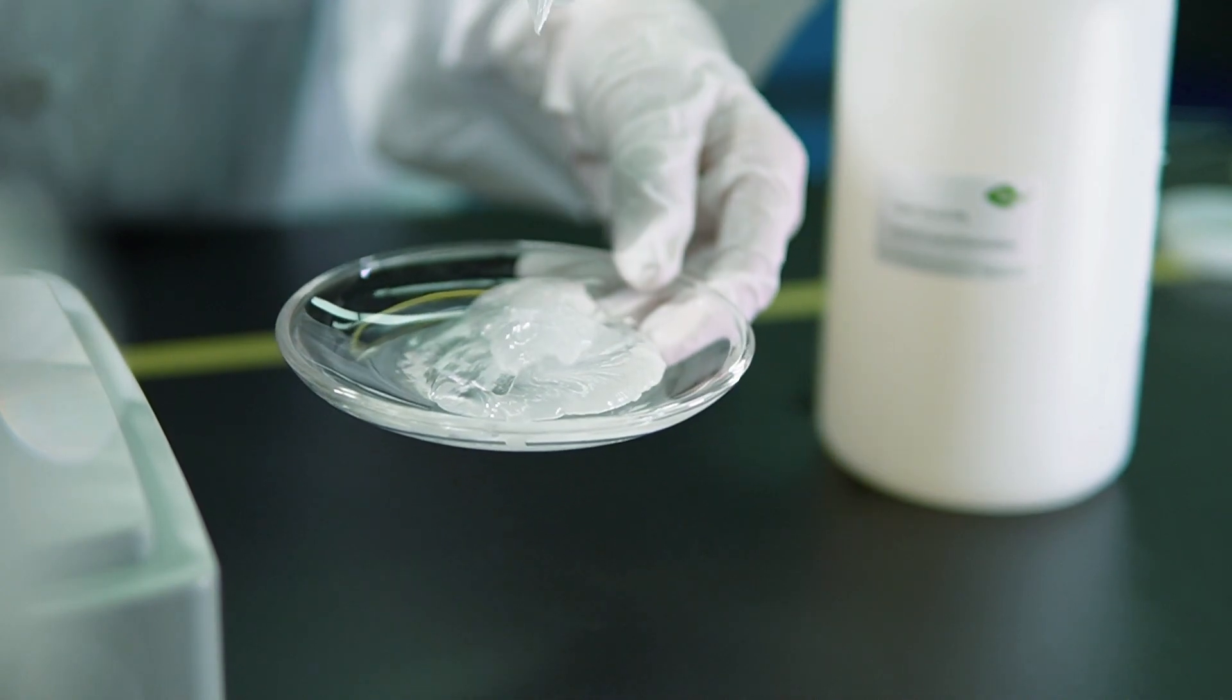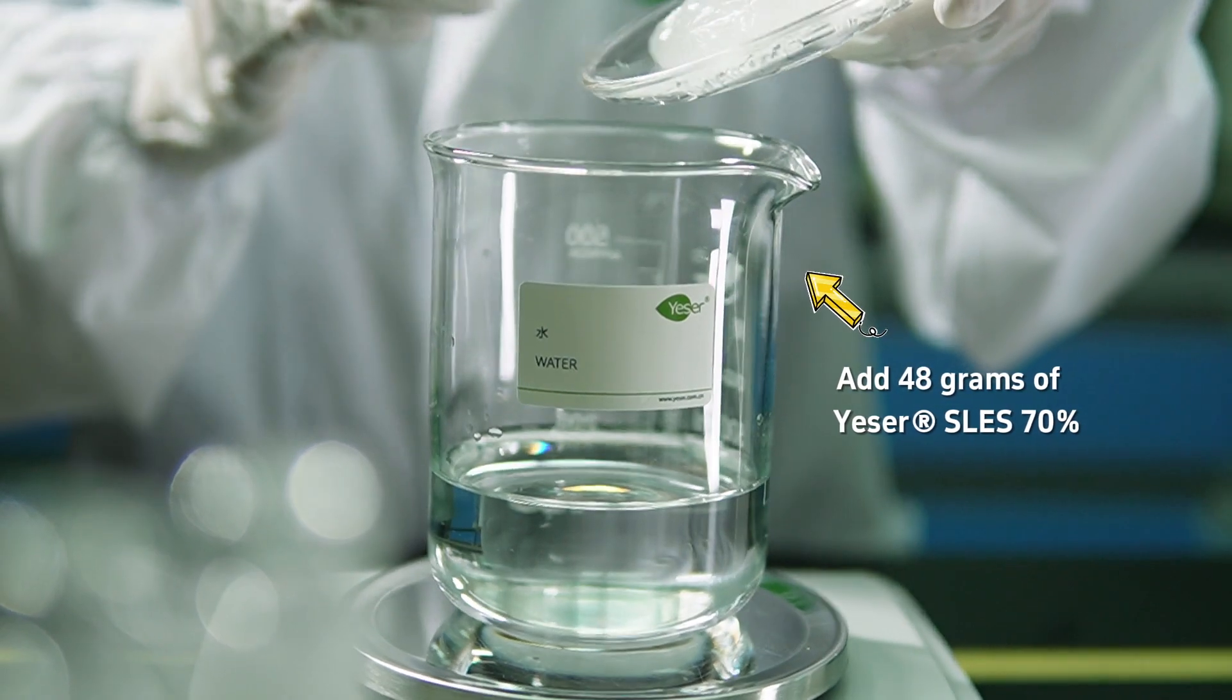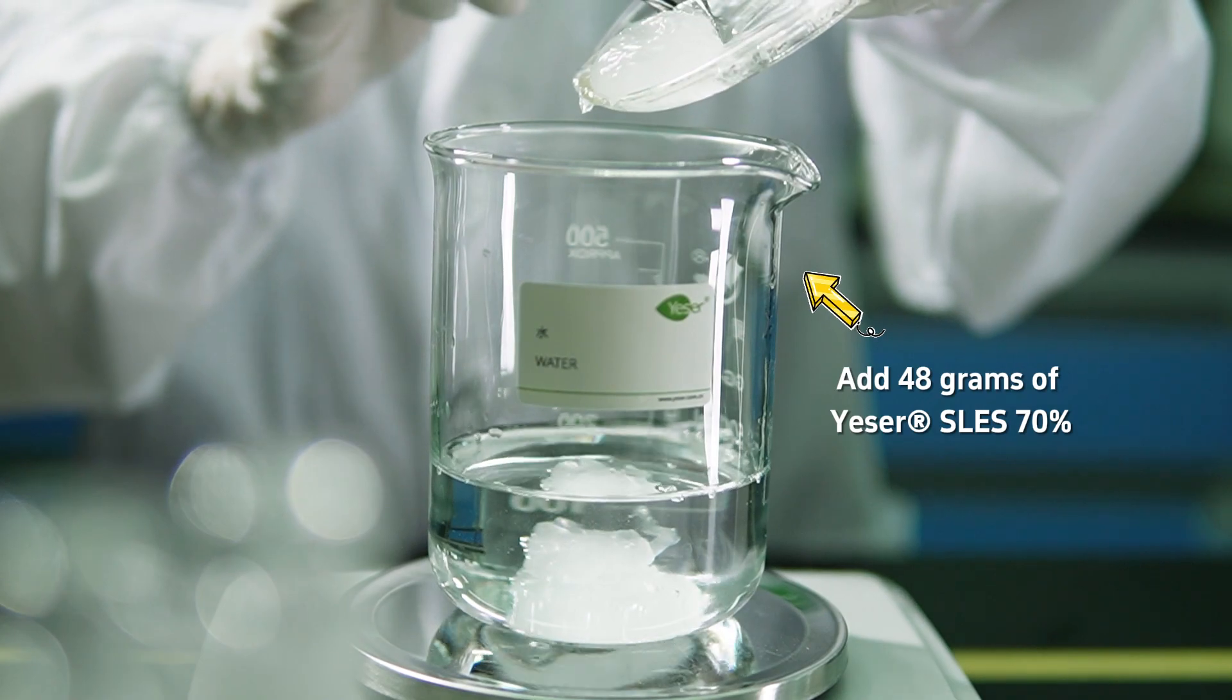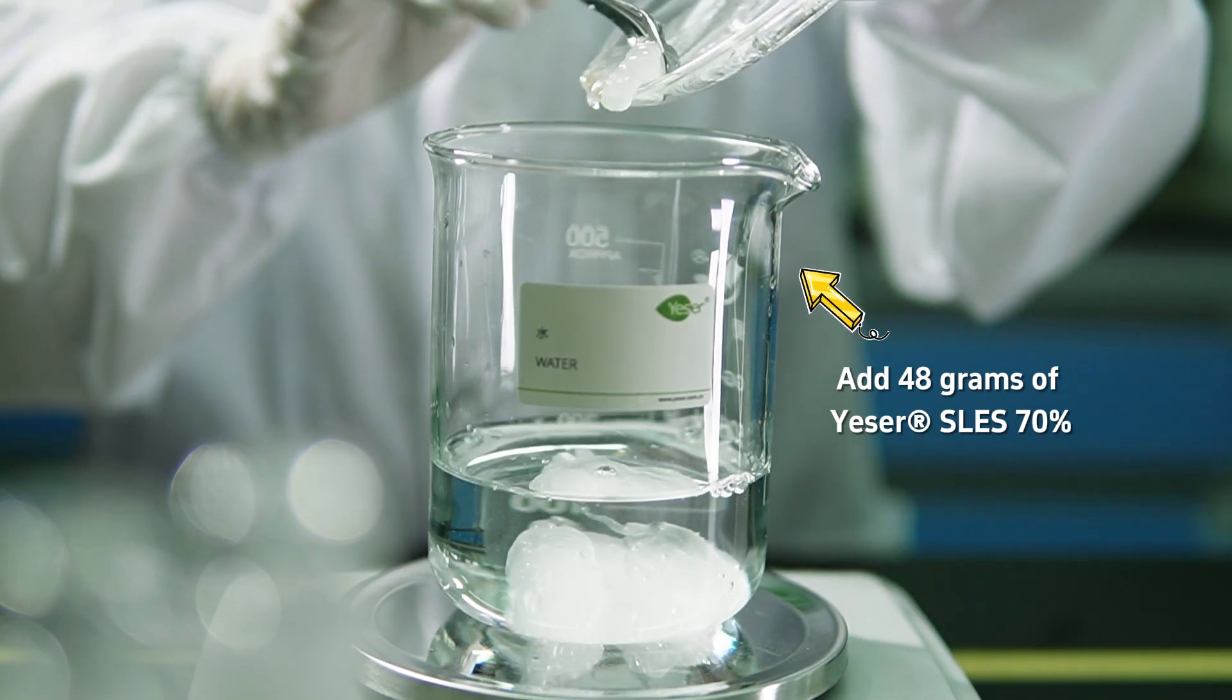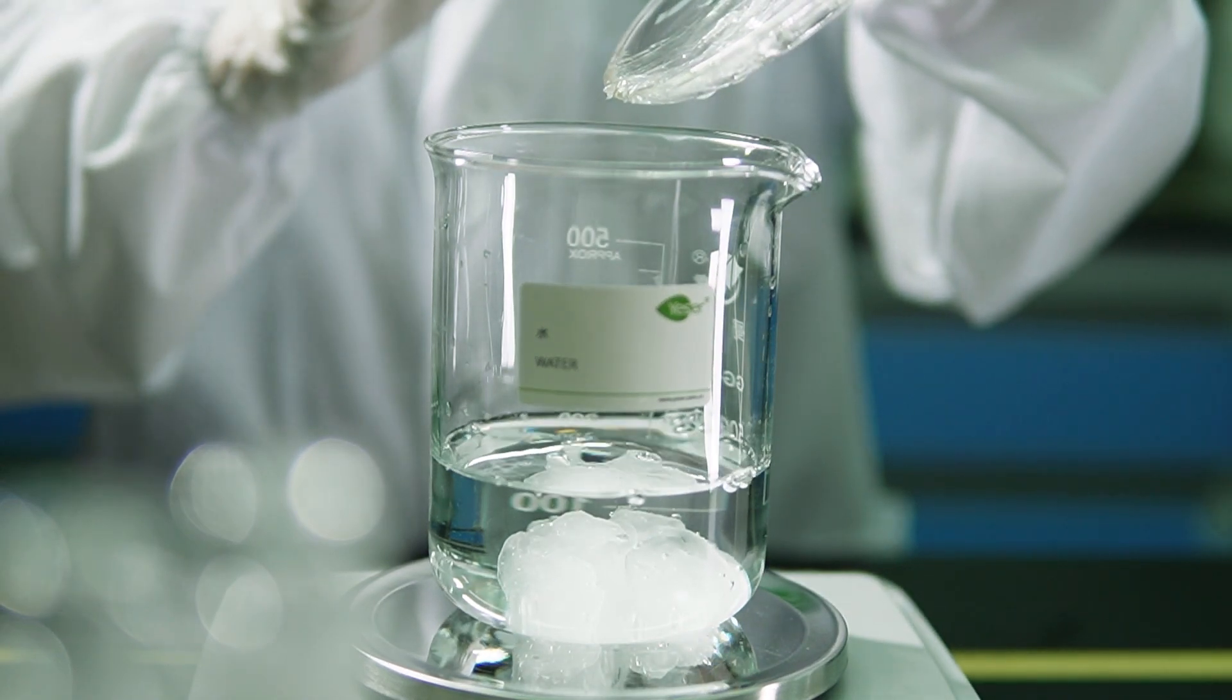It's a mild coconut-derived anionic surfactant with a great balance of cost and performance, dominantly used as a cleansing and foaming agent in mild skin touch products. For today's formula, we're adding 48 grams of SLES. That's about 16% of our total 300-gram batch, just the right amount to give our bath gel its luxurious foaming property.